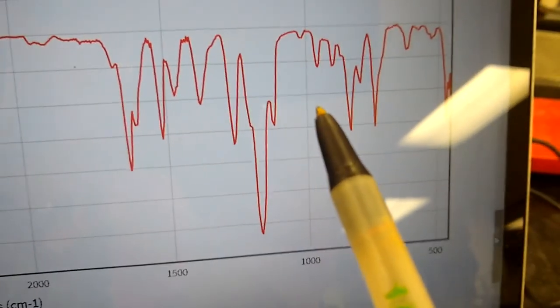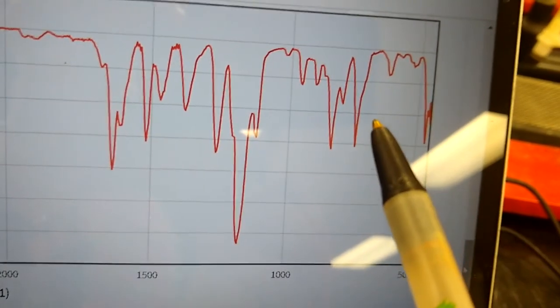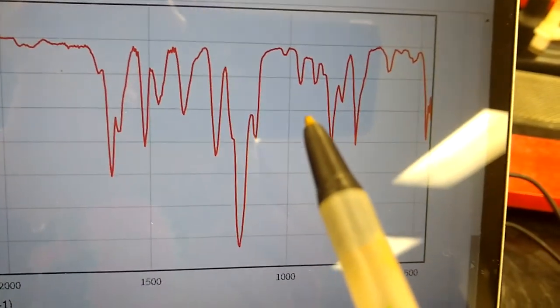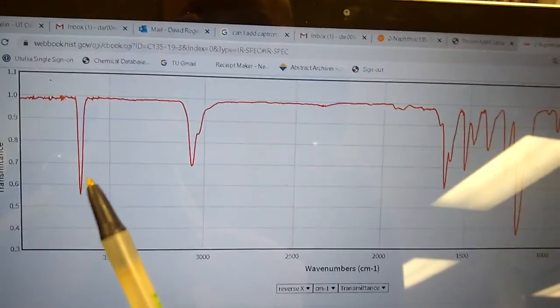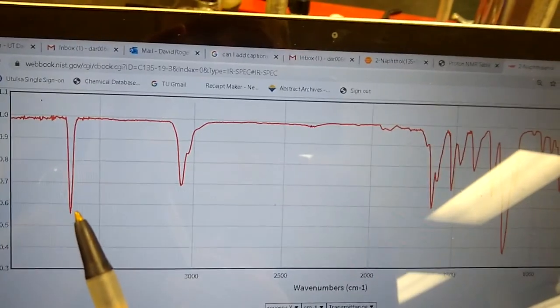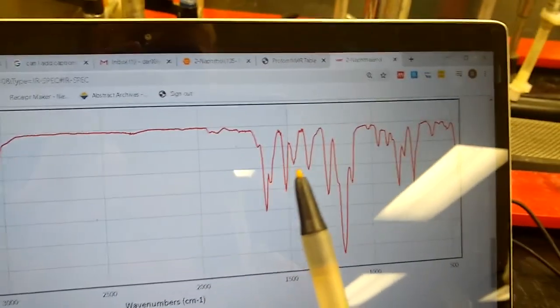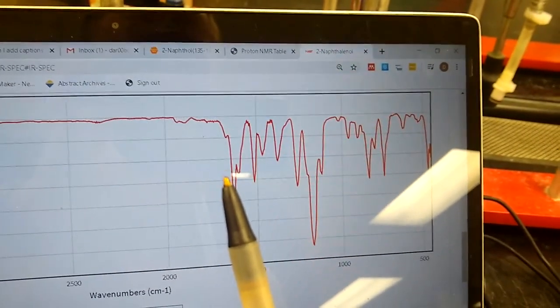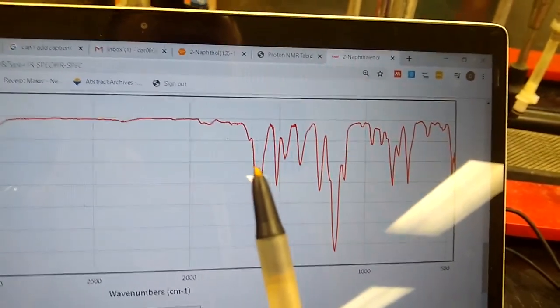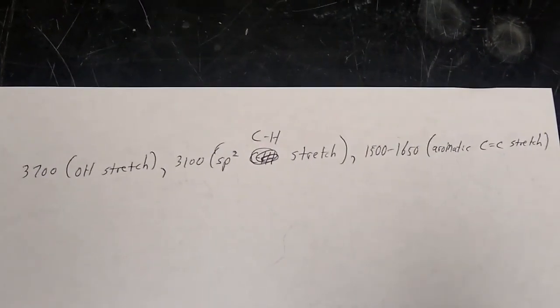Getting further to the right, you're getting into the fingerprint region, and that's usually not very informative, so you can for most cases just ignore that. So for the IR of two-naphthol, the only really valuable signals you would say: 3700, OH stretch; 3100, sp2 CH stretch; and then you could say just estimate 1500 to 1650, and that would be aromatic C double bond C stretch. Written out like something like this, and that would be good enough for me.